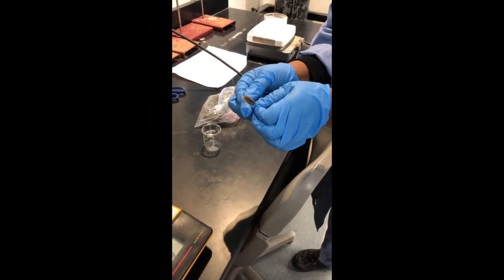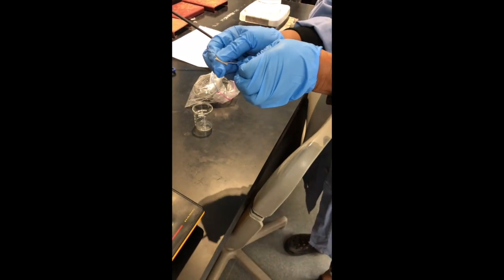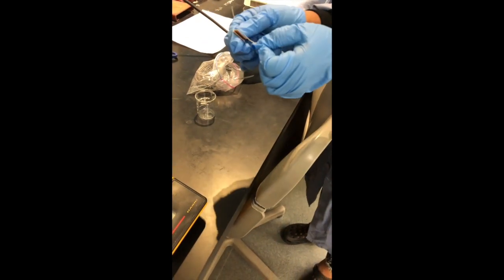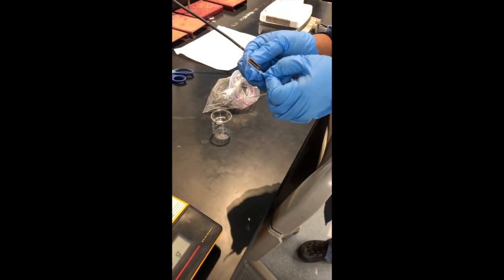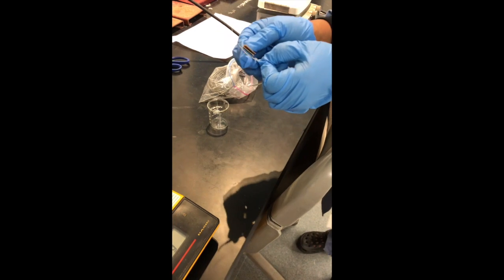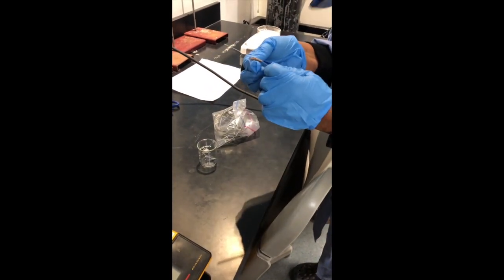We are now measuring the magnesium out for the Grignard reaction. We have obtained several centimeters worth of magnesium that adds up to just over 0.3 grams, and we're sanding off the outer surface. Once we sand that off, we will re-weigh it and cut it to the exact weight before we chop it into pieces. We have sanded this magnesium down to a weight of about 0.301 grams.